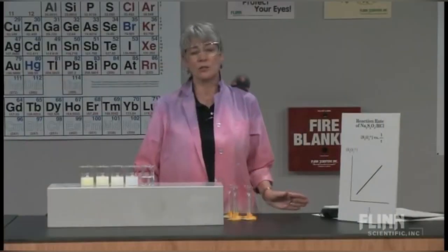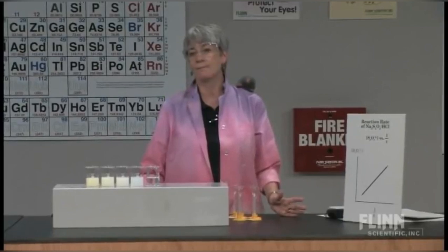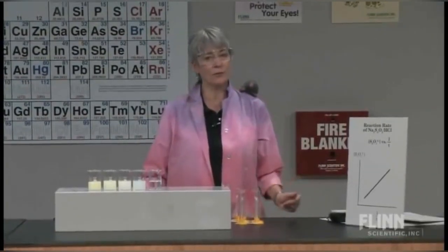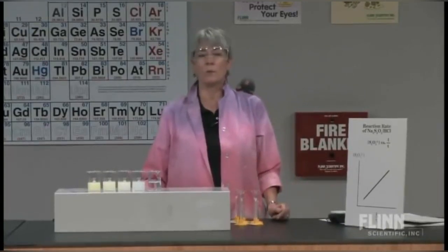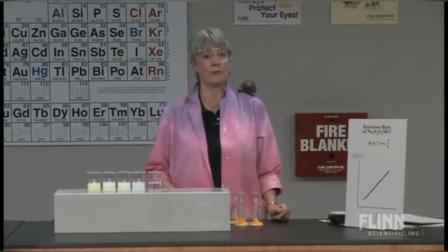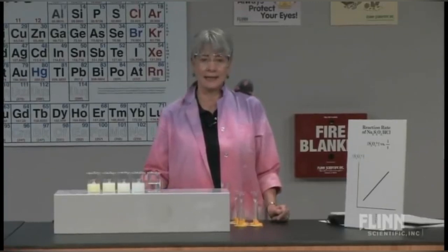rate constants, you can say this is first order with respect to concentration. Otherwise, you can just talk about the fact that it's an inverse relationship, but it's directly proportional. And you can ask them, well, how could I test to see what the relationship is with the amount of acid? There are 2 reagents involved, the thiosulfate and the acid.